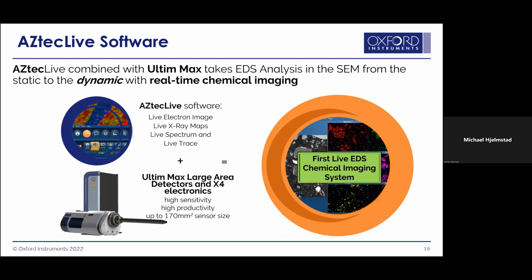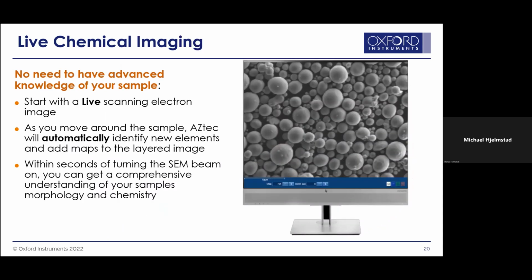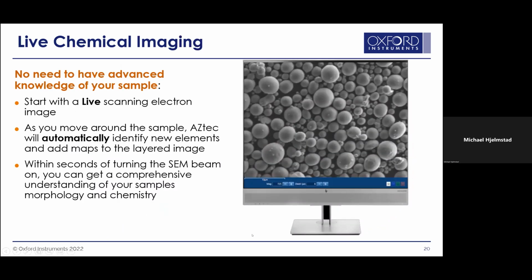And again, I think there's a couple systems in the center that have the Aztec Live capability, but this is something that is really a driving force for Oxford now. It's really kind of the state of the art, so I wanted to mention it really quick. This is a pretty good video here.